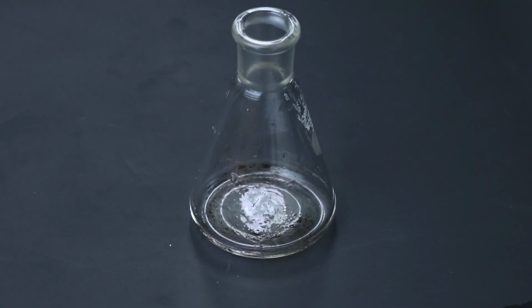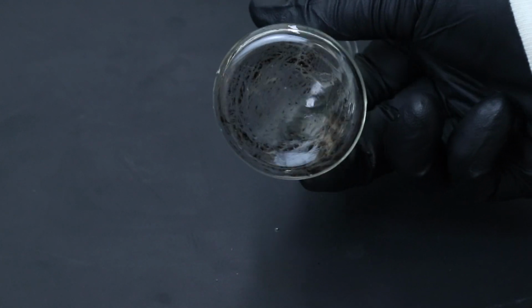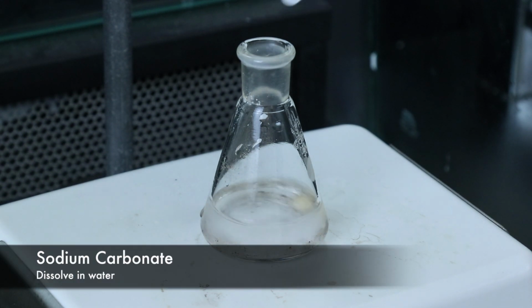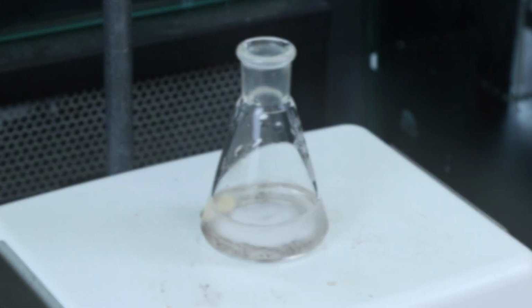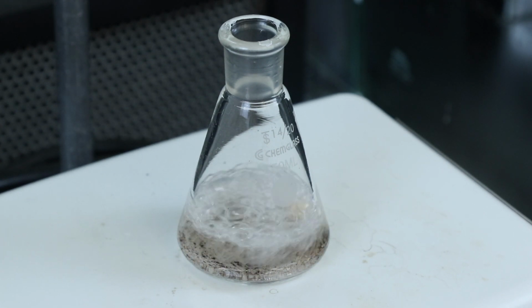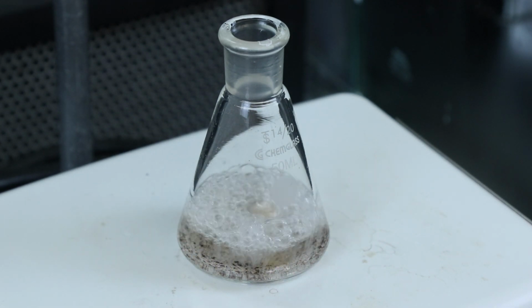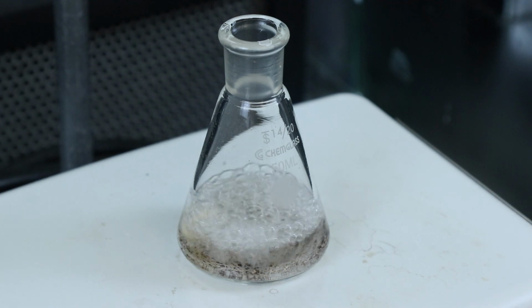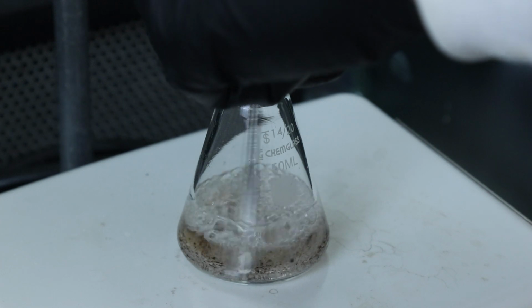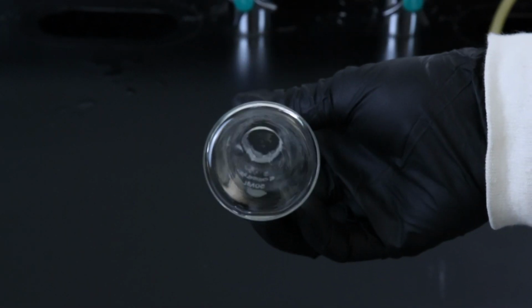You can see that there is still some burnt residue on the bottom of the flask that I'll need to clean off, so I'm going to add some more water and add about a gram of sodium carbonate and heat up the solution to help remove that burnt residue. The solution can be allowed to boil, but be careful because if there's still a good amount of cinnamon left, it can actually boil over and come out of the flask, so just monitor it and don't leave it there. And a spatula can be used to help scrape off the burnt cinnamon. And this should be continued until the Erlenmeyer flask looks just as clean as it was initially.